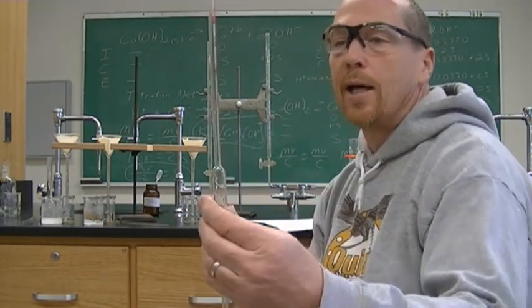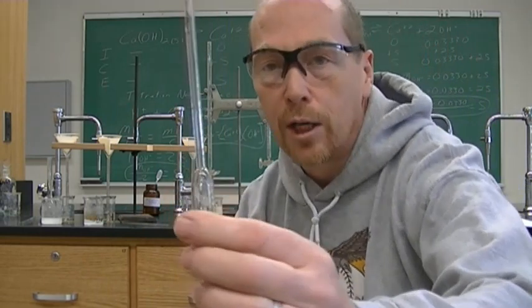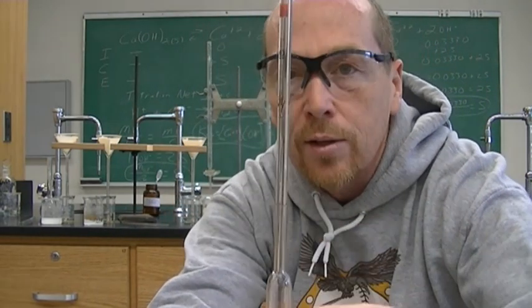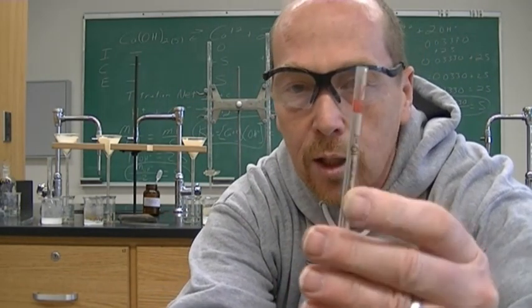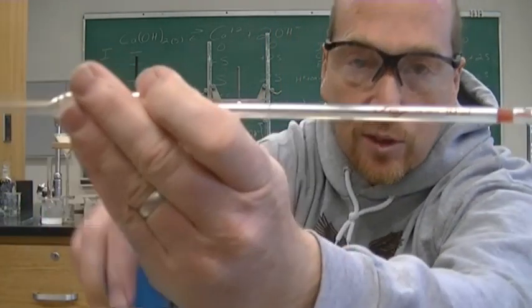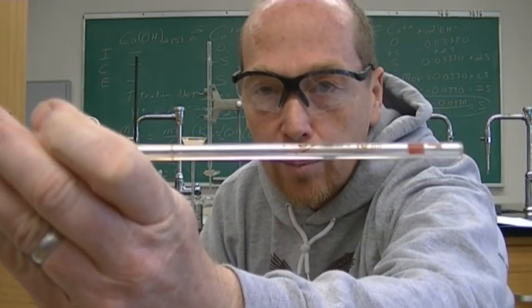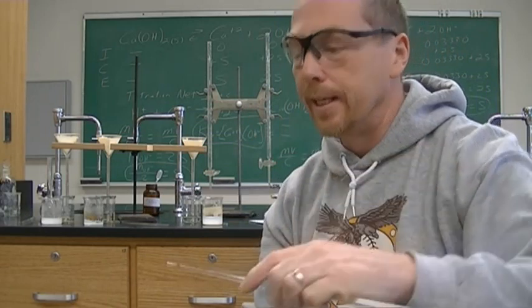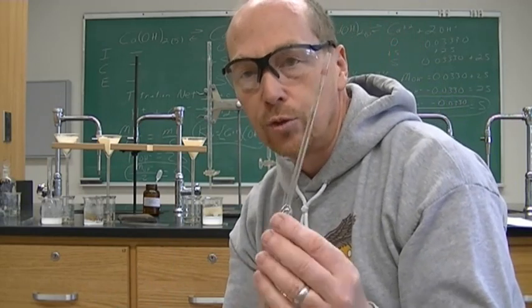A pipette is very accurate. It's similar to a volumetric flask in that there is just one line. That is it. This is a 10 milliliter. I probably can't see it, but anyway, it is a 10 milliliter. It says that upside down, yes. All right, so not 0.1 milliliter. It's a 10 milliliter. And it says TD, all right, at 20 degrees Celsius. So we are at 20 degrees Celsius, and TD means to deliver.